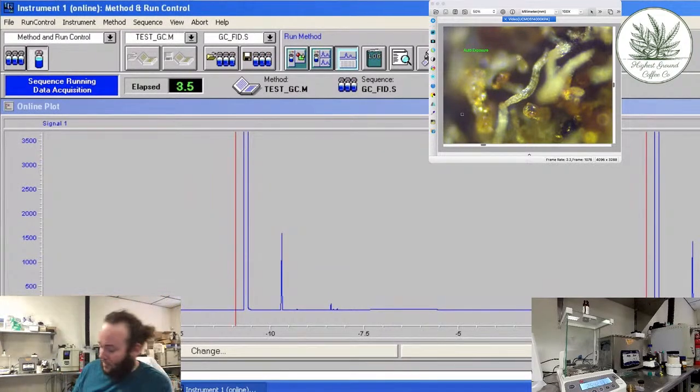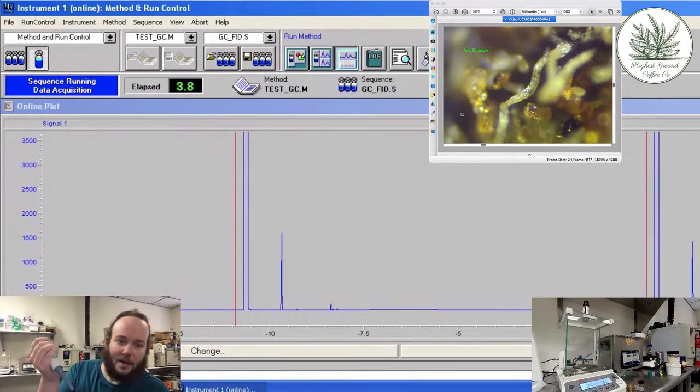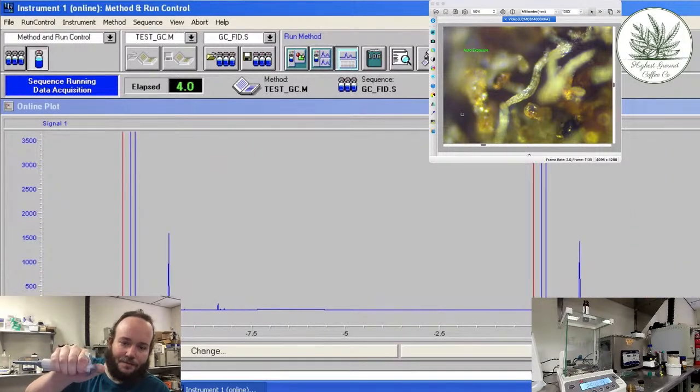So we did a 10x dilution on the 125 part per million standard. However, if you've never used a mechanical pipette before, it's very feel based. There's basically this lever that you press that has 2 levels. So that's the first level, and then that's the second level.